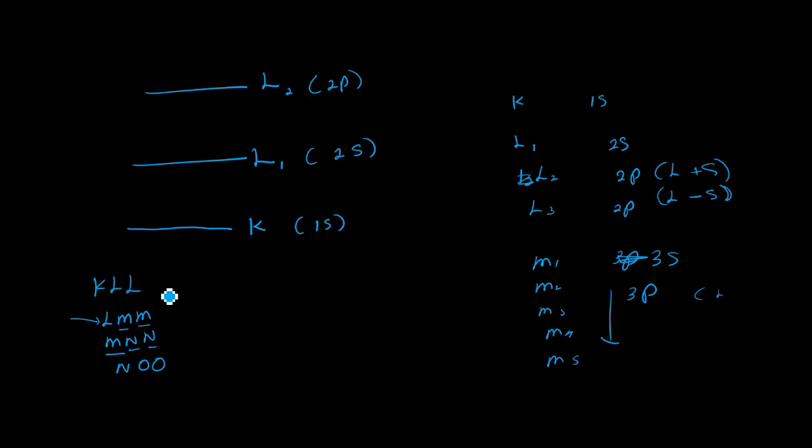So these kinds of representations are there. Normally KLL means very low atomic numbers, like 3 to 14, such as carbon and nitrogen. These elements follow this Auger process, while LMM is particularly in the middle range, let's say atomic numbers 14 to 40.